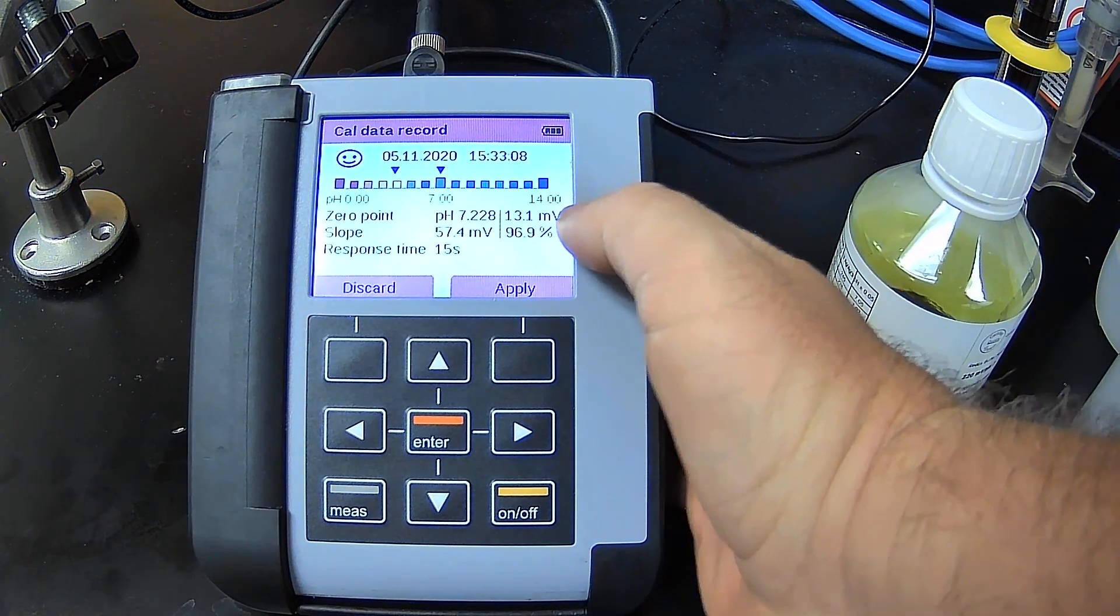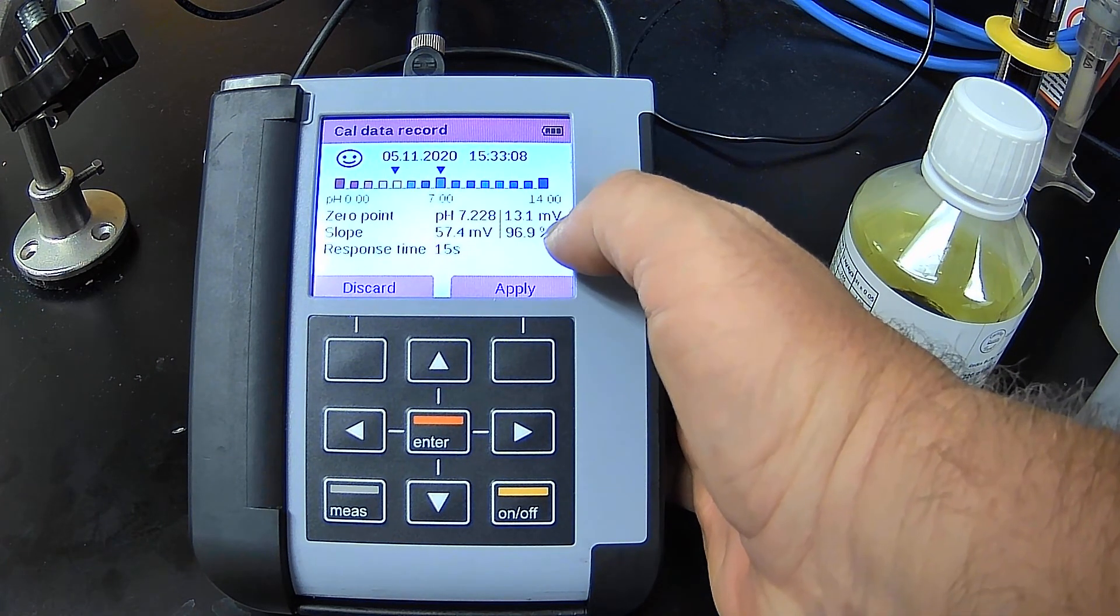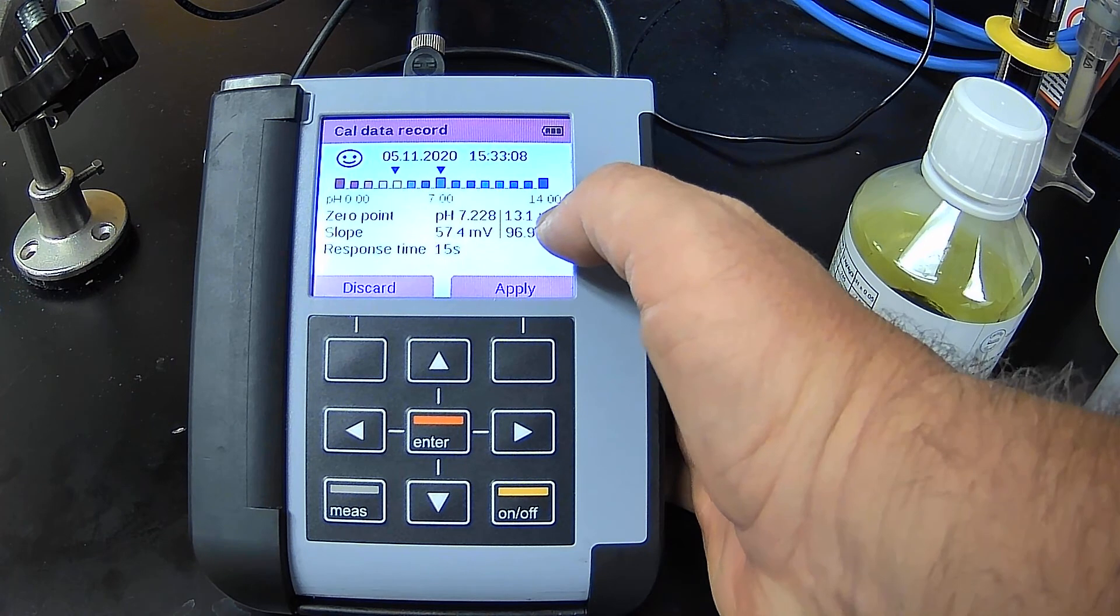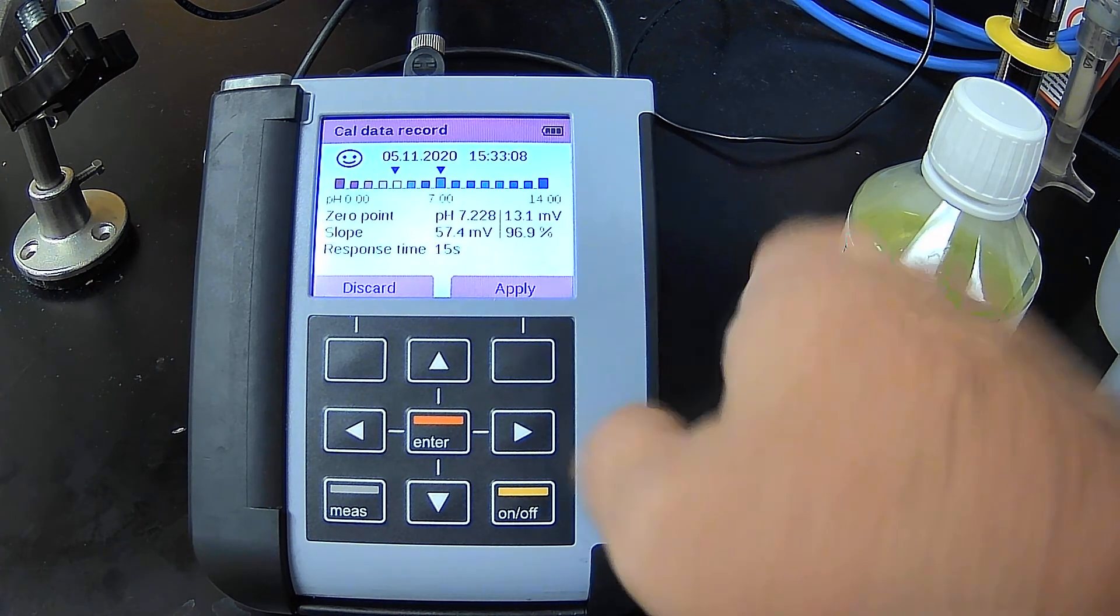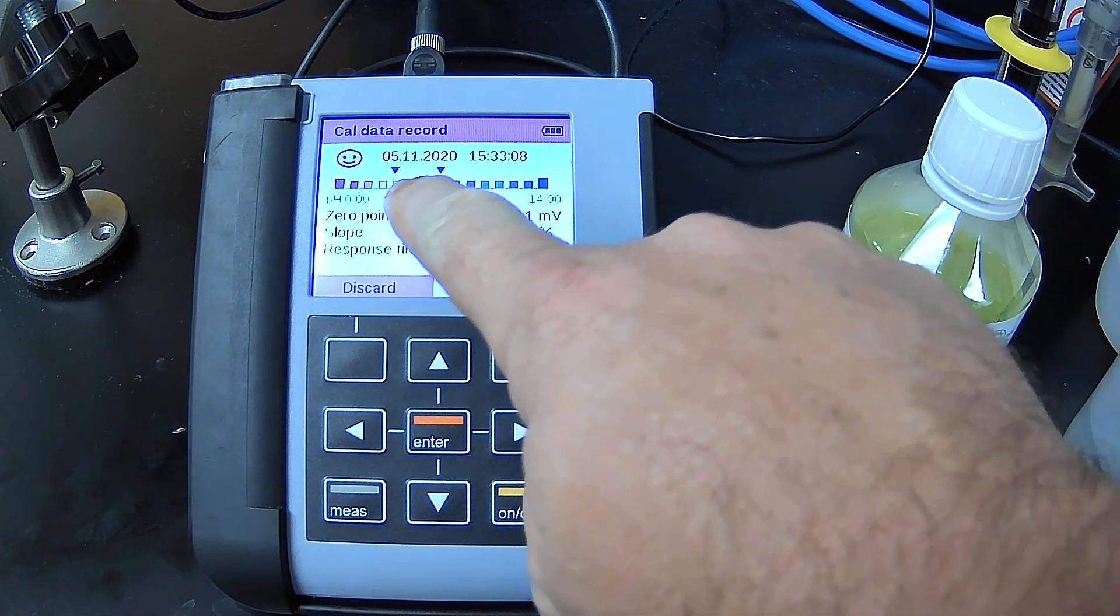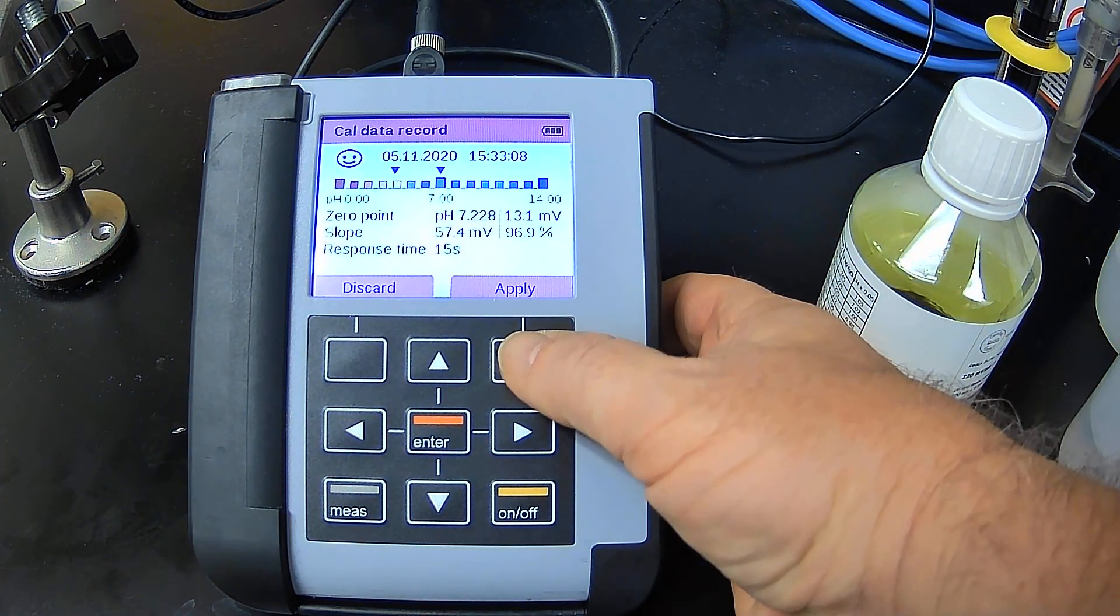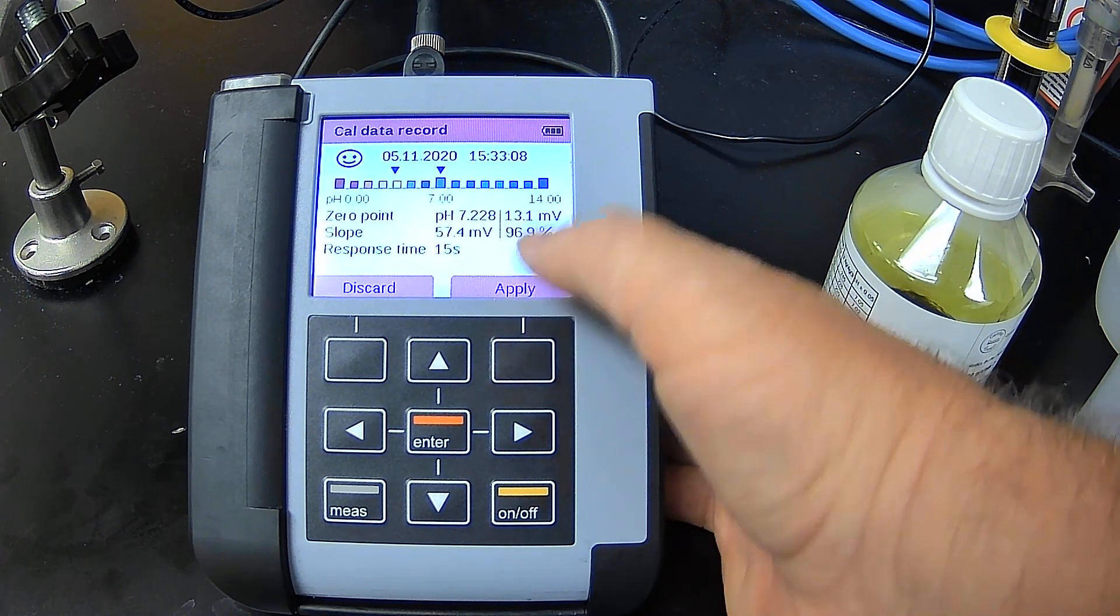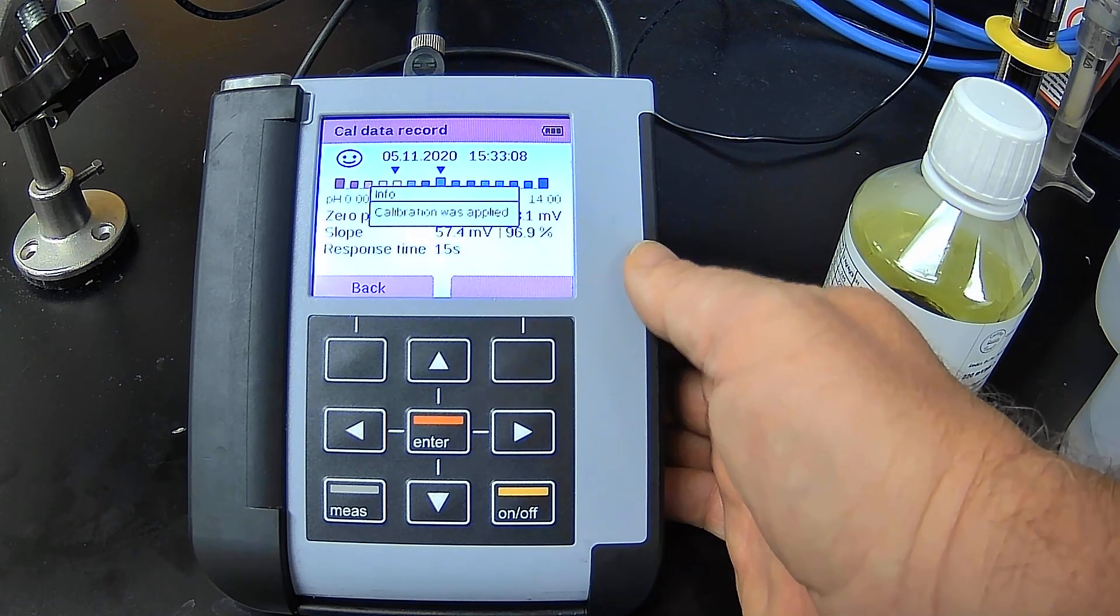Here we go. Here's the results of my pH 2-point manual calibration. So I've got a response time of 15 seconds, a slope of 96.9, a zero at 13.1 millivolts. It's showing me my two buffer values, 4 and 7, and it's giving me the smiley. So of course, if I don't hit apply, that calibration will not be put into the electrode or the adjustment won't take place. So remember, you have to hit apply.